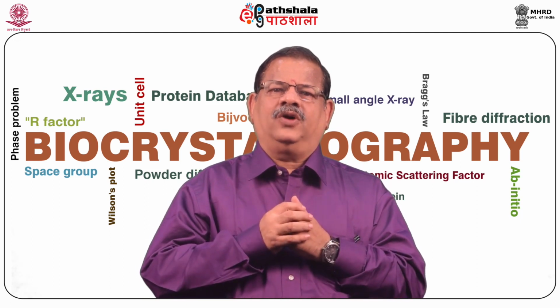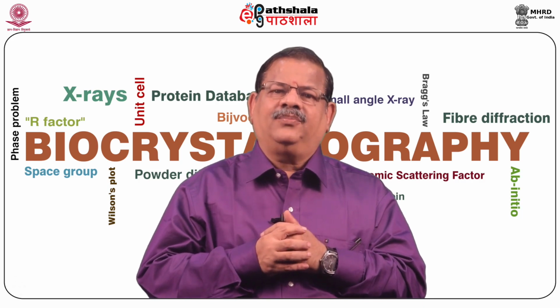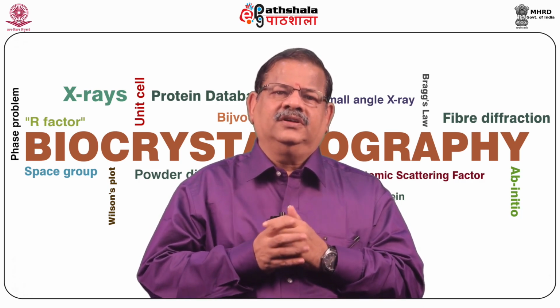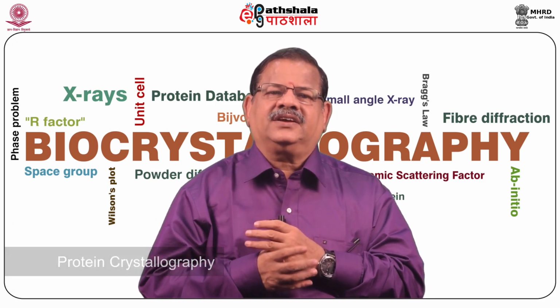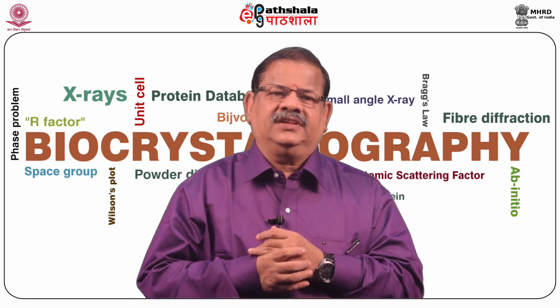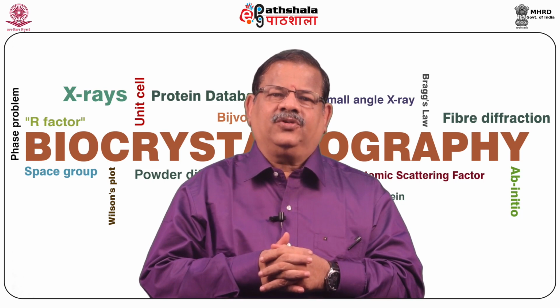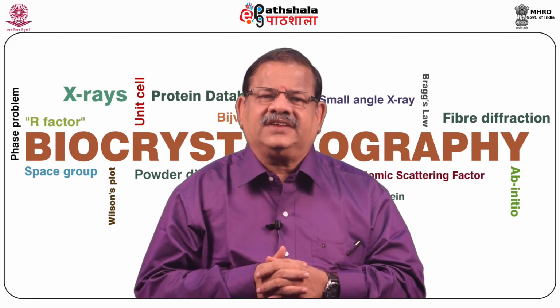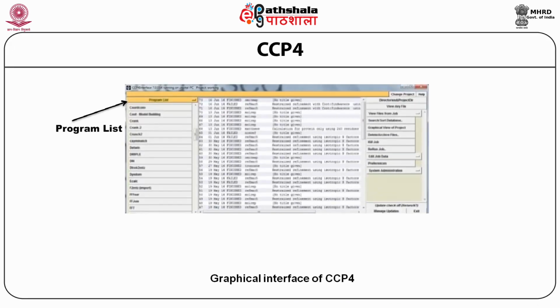Extensive details can be found about the program suite from the following reference and website: Collaborative Computational Project number 4, 1994, the CCP4 suite, Programs for Protein Crystallography, which was published in Acta Crystallographica section D 50, pages 760 to 763. The website is http://www.ccp4.ac.uk/dis/html/index.html.